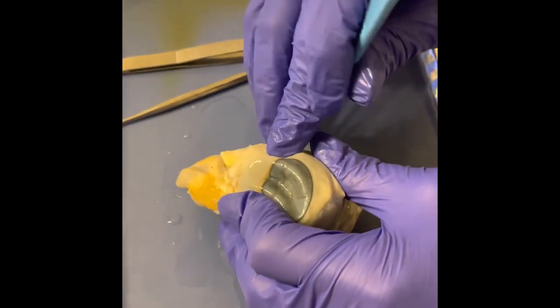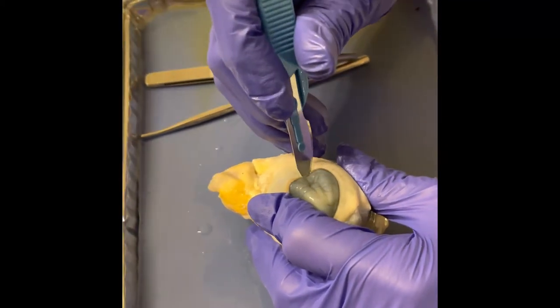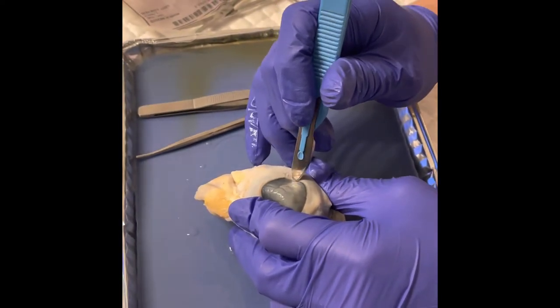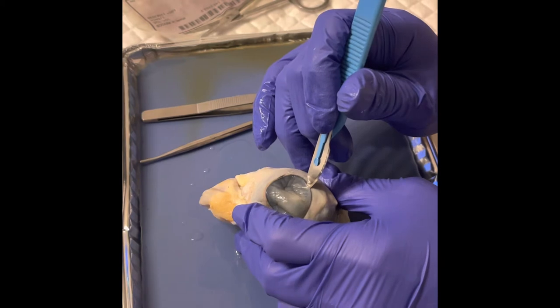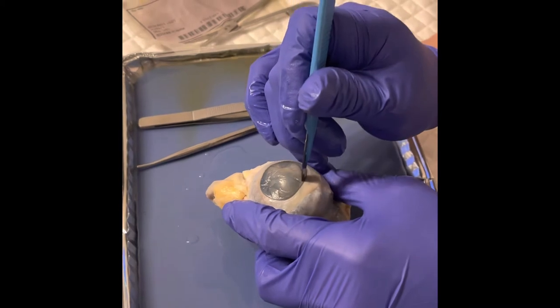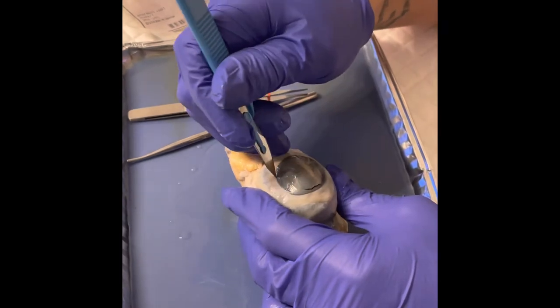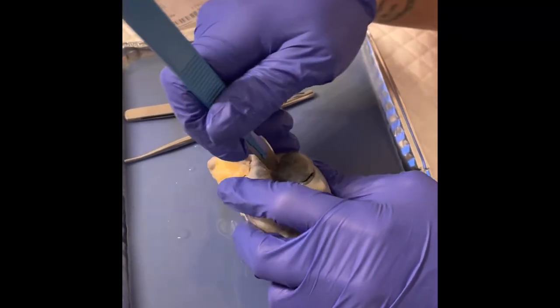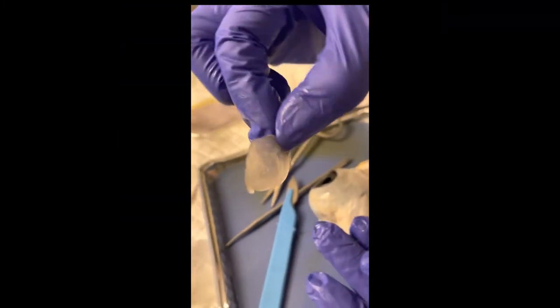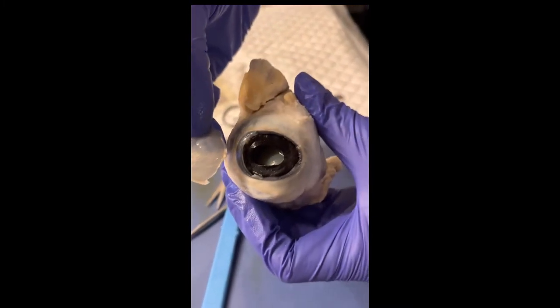For my first incision, I began cutting right along where the cornea and sclera meet. As I cut precisely and carefully, I was able to notice the cornea is clear and perfectly round in size. Just below where I cut out the cornea layer of the eye is the iris and pupil.